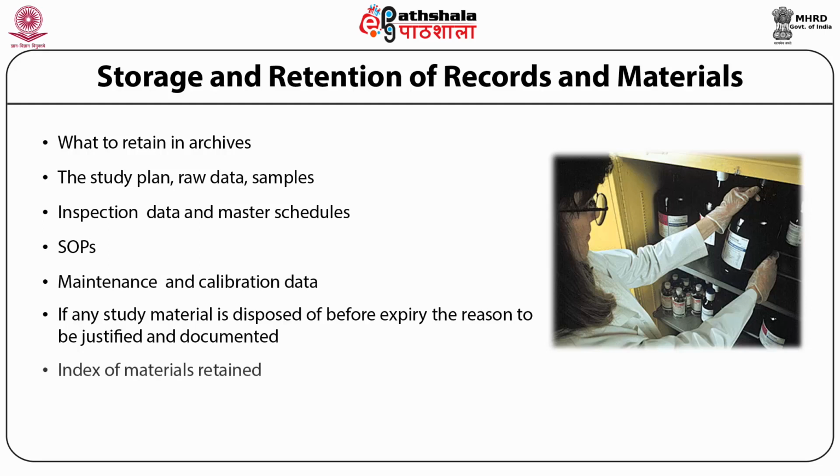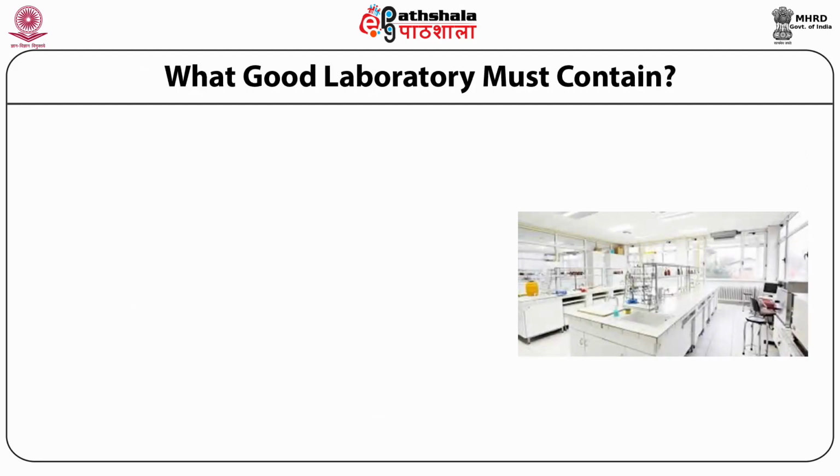It also includes an index of material retained and environmental assessment of health and safety monitoring records. This all should be stored and retained in the proper documentation forms. So what must a good laboratory contain?